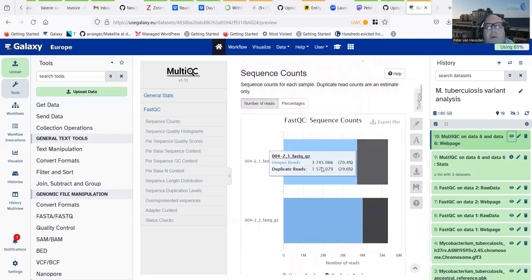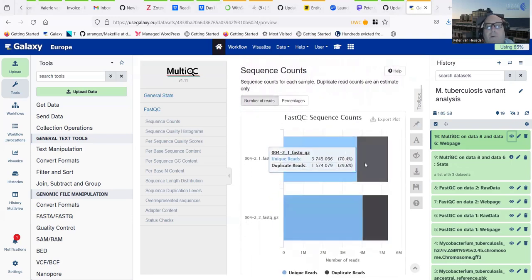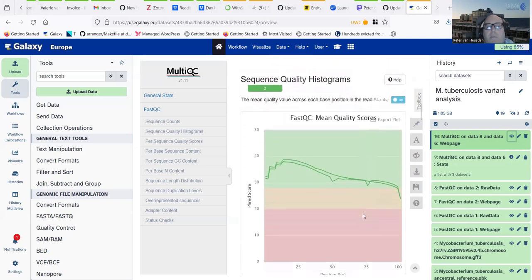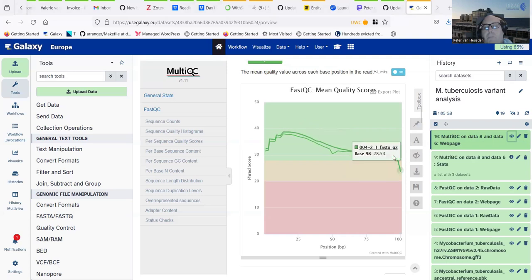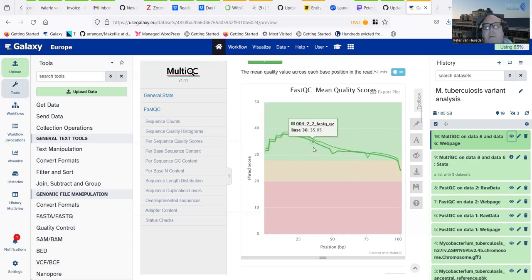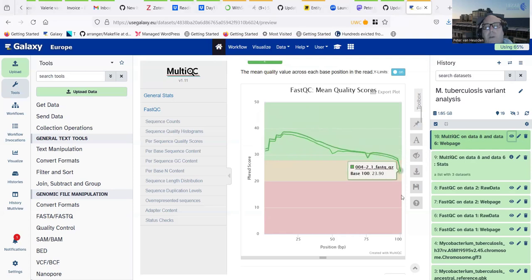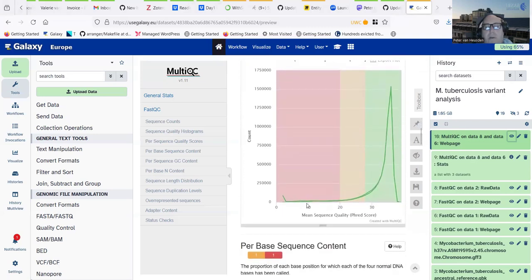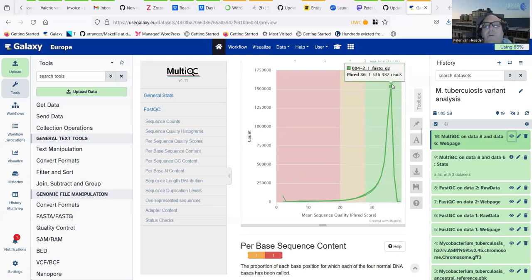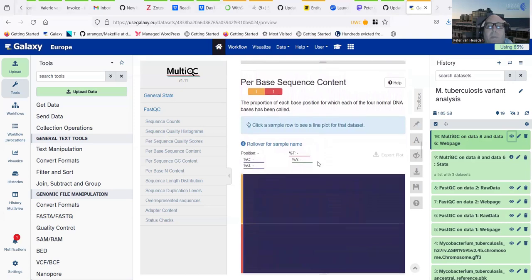MultiQC has already selected dataset 8 and I click next to this and select dataset 6, which is the raw data from the other one — FastQC on data one and FastQC on data two. The MultiQC run is finished. Looking at the output: overall statistics show 5.3 million sequences in both forward and reverse datasets, a high proportion of duplicate sequences probably from amplification during library construction, and the GC content — the percentage of reads that are Gs and Cs — characteristic of a particular species.